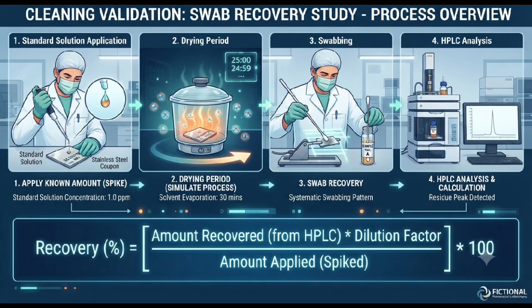Recovery study. Now, recovery study is the most important parameter. A recovery study demonstrates how efficiently the sampling method removes residue from the equipment surface. A known amount of the target compound is applied to representative surfaces, allowed to dry, then recovered using the validated sampling procedure.